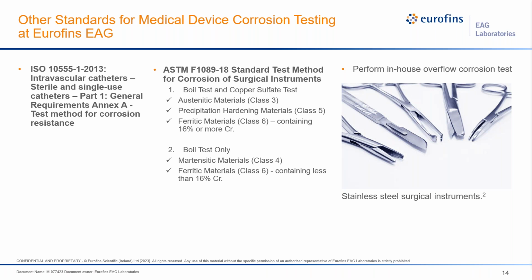If iron particles are on the surface, the aqueous copper ions will react with the free iron particles and create an oxidation reaction resulting in copper deposits on the surface. If this is observed, then the test has failed and the material has an unacceptable amount of iron present.